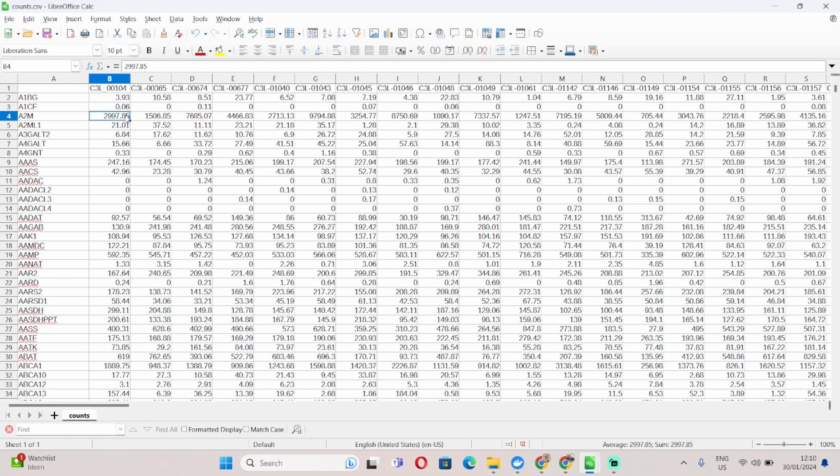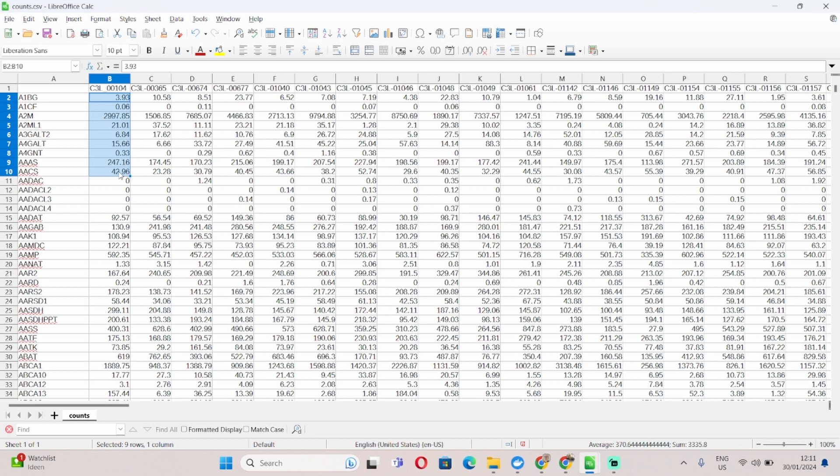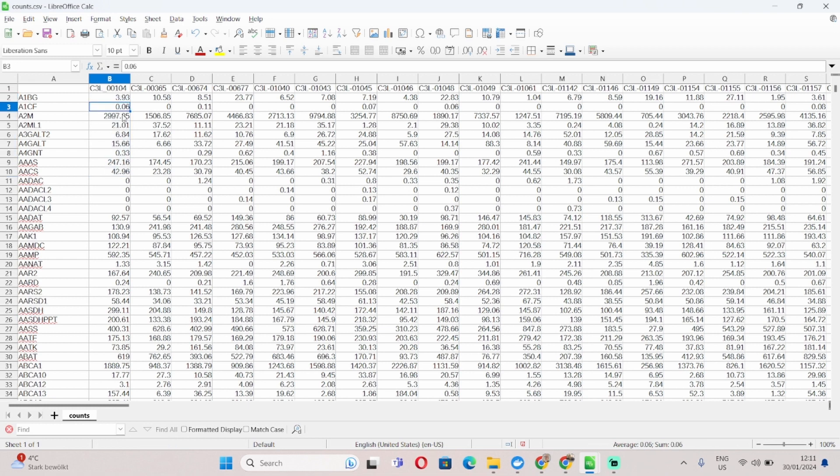An important note about the formatting of the numbers. The platform accepts international numbering formats. But if you start working with some of your local numbering formats, for example the Dutch numbering systems, this can cause problems with the platform. So I strongly suggest if you're using a local numbering format, that you convert it to an international numbering format such as this one, or you can also convert it into the scientific numbering format, which works absolutely fine with the platform.